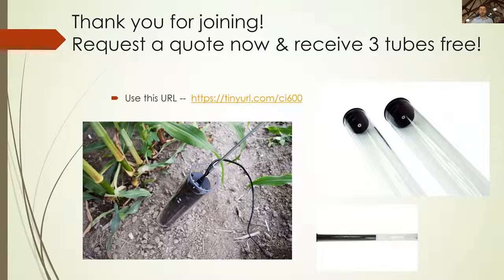The next question is actually a very good one. How often do you have to calibrate? You don't have to calibrate after each measurement. When we do request, you just stick it in the tube, press calibrate on the screen, and do that once a day if you're staying at the same DPI and fairly similar temperatures. If you are changing temperatures, say going from one acrylic tube in soil at 80 degrees Fahrenheit, I'm from America, to another where the soil is at 50 degrees Fahrenheit, you're going to see that the acrylic tube itself changes its diameter just slightly. So we provide a way to adjust the scanner head on the device itself. It's really simple, just adjust the screws. The scanner head will raise a little bit or lower a little bit depending on its connection with the acrylic tube. We make that really easy, but after that, you definitely want to calibrate again.